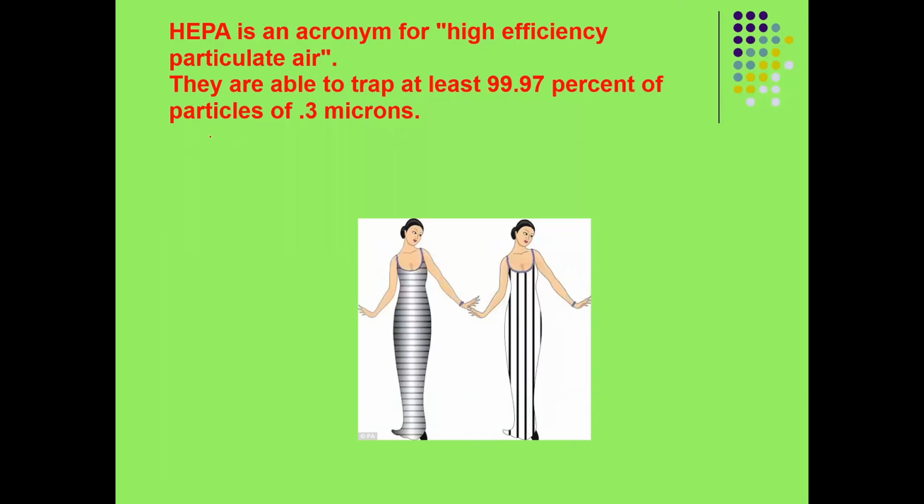So this is one thing. And we were talking about the laminar flow. Laminar flow has a filter called HEPA. Now HEPA is very common. I bought this small aspirador, a vacuum cleaner. It also has a HEPA filter inside. So HEPA is now very common; it is being used in air conditioners.